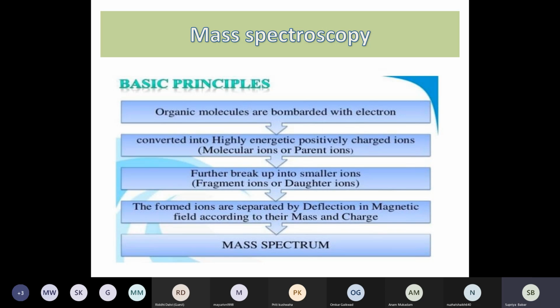Then after functional groups, then carbon and hydrogens present. After that, normally mass spectroscopy is done. In mass spectroscopy, the molecule gets fragmented, and you get various peaks, like a base peak and a molecular ion peak.